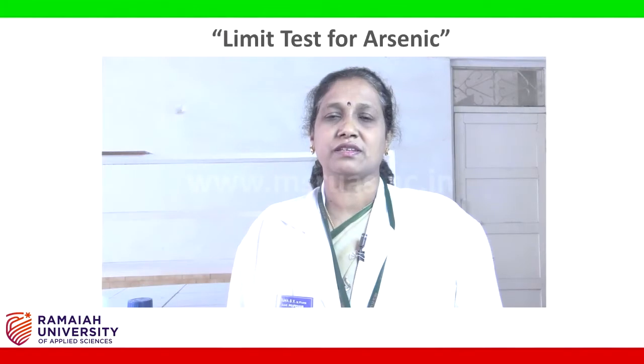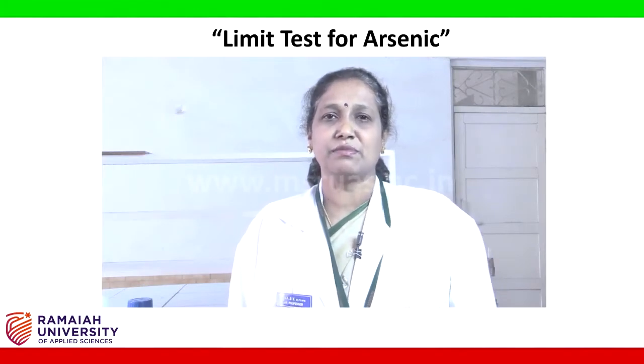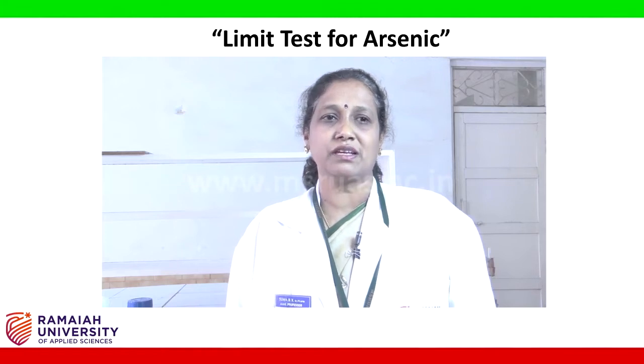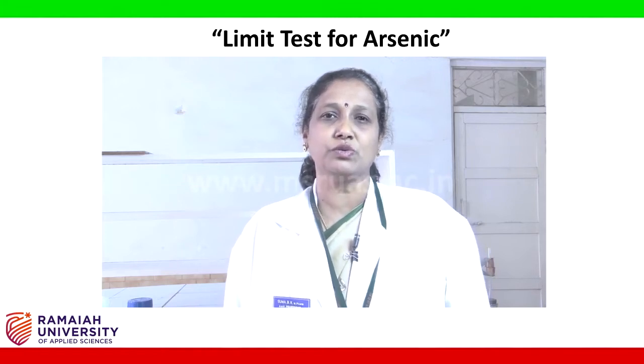Hi students, the title of the experiment is Limit Test for Arsenic. The aim of the experiment is to carry out the limit test for arsenic and to determine whether the sample is suitable for pharmacopoeial use or not.